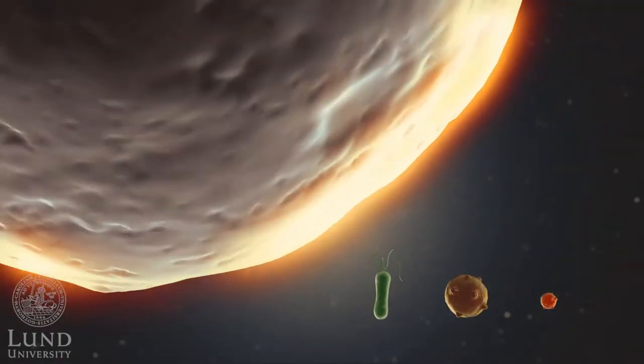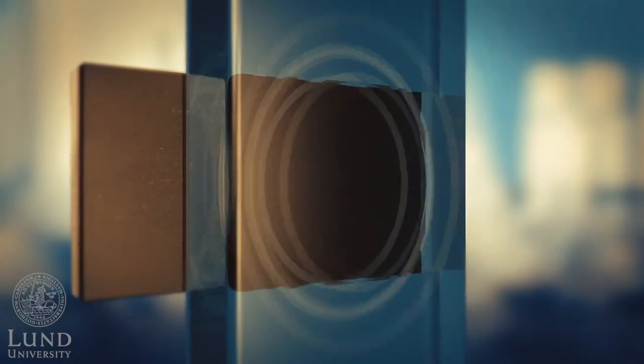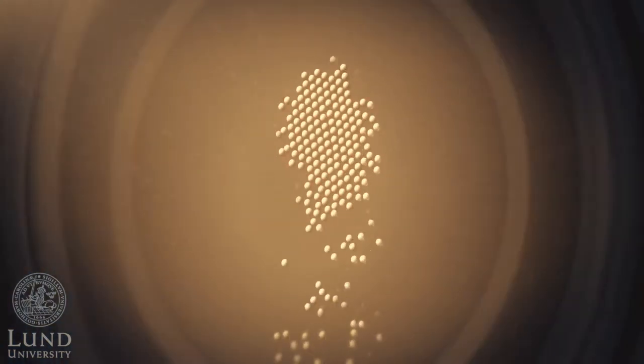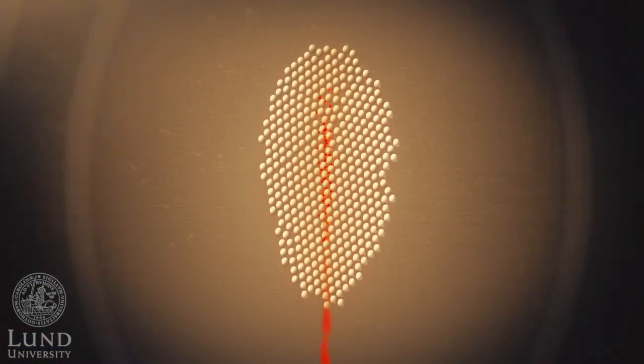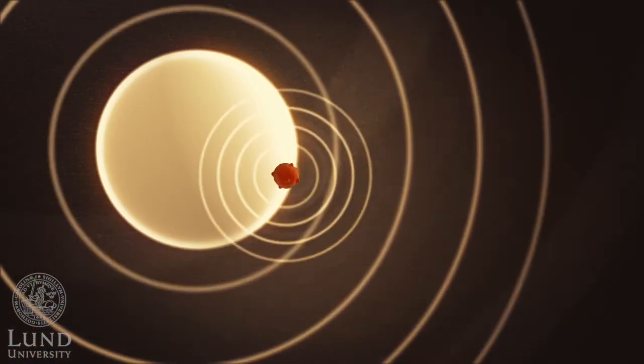Smaller particles such as bacteria, microvesicles, and exosomes can't be trapped directly in the acoustic trap. But by first loading the trap with larger seed particles, smaller particles can also be trapped when interacting with the larger seed particles.